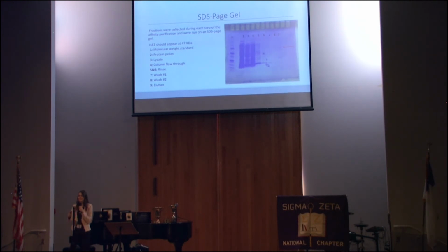So, how do you get this protein? Which tag, histidine tag? Did that totally attach to this protein? Oh, yes. Okay, so I didn't talk a lot about the gene and putting that into the plasmid. But when we created our plasmid, we did two things to the HAT gene. We made it ampicillin resistant, and then we added a 6-histidine tag. This tag has a high affinity to cobalt. So ideally, when your bacteria makes your protein, at the end of your protein it's going to have all these histidine amino acids, right? And that binds to it.